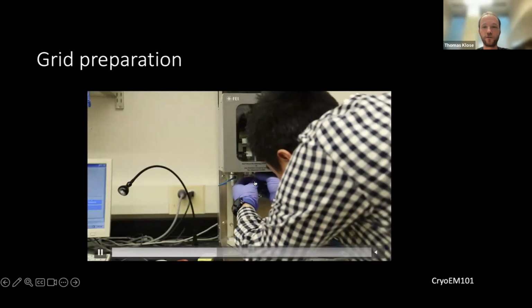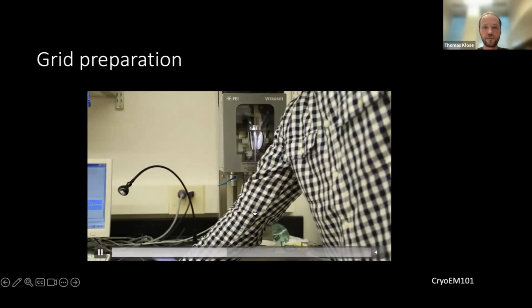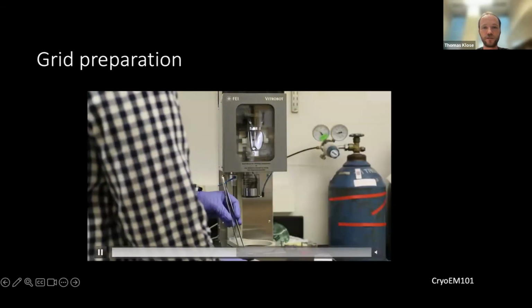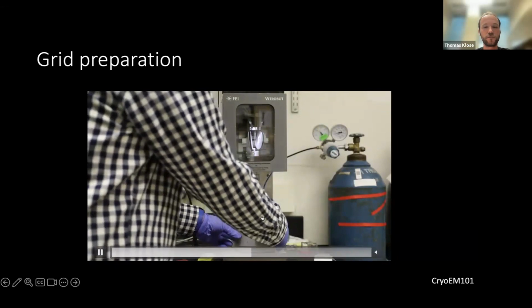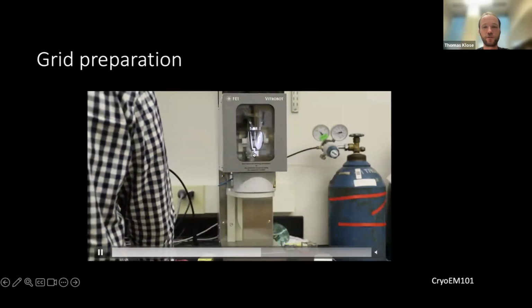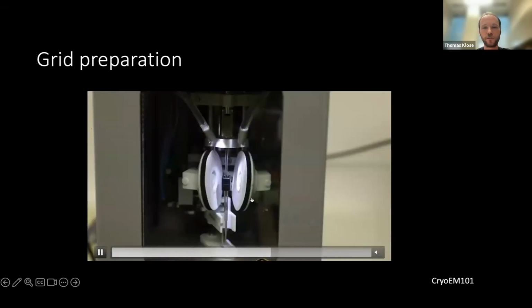Now they are mounting the tweezers, which have the grid attached down here. And it gets pulled up into the robot and is sitting here. Then they will place the nitrogen freezing container down here. It gets lifted up really close to the chamber. The tweezers lowered a little bit.